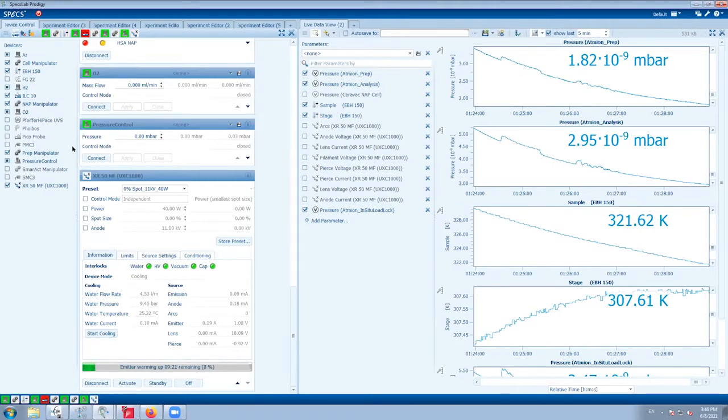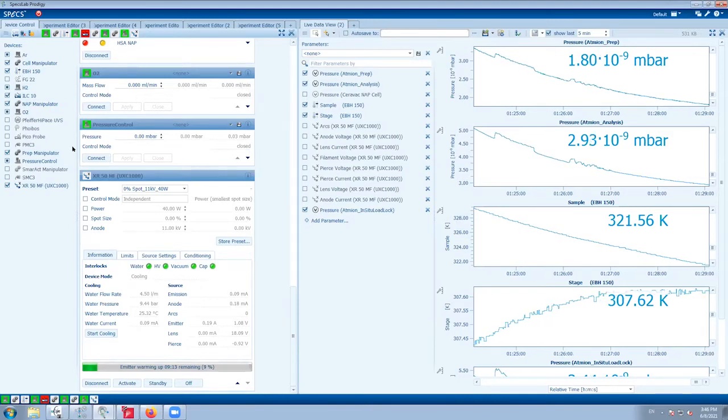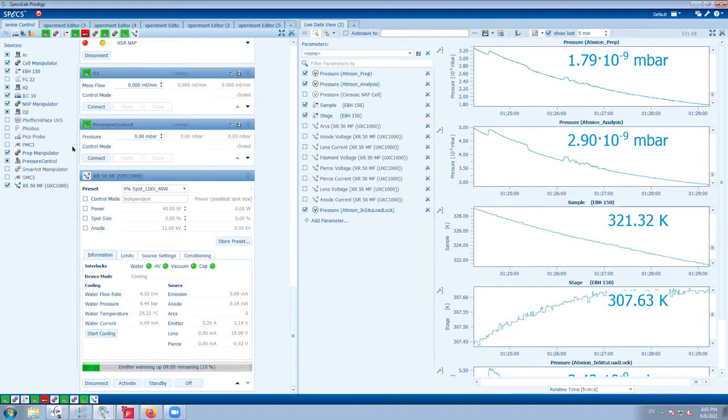Maybe we can look at this software. I don't know if somebody of you installed this HERCULES fitting software, which Brett sent. Yes, I did. So we can maybe share this second screen, which we use for spectral processing, because we will measure some spectra of palladium, which we already have here. Can you share the screen here? The thing is that if you don't have the software installed, how can I do it? I don't know if we can both share the screen. I think only one person can share the screen.